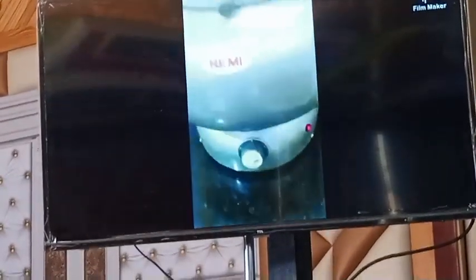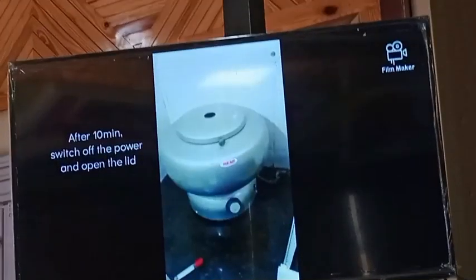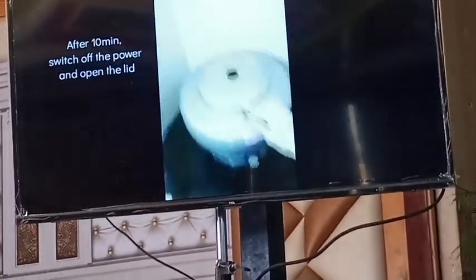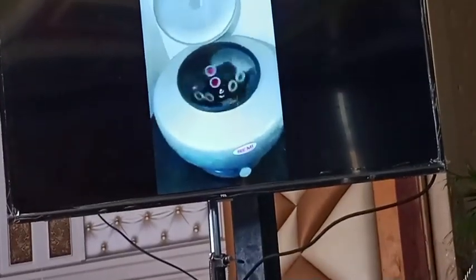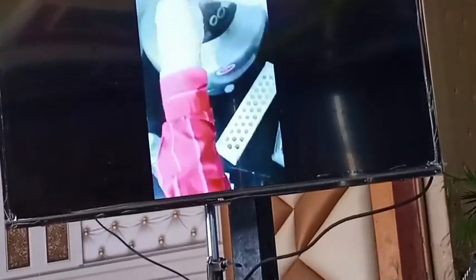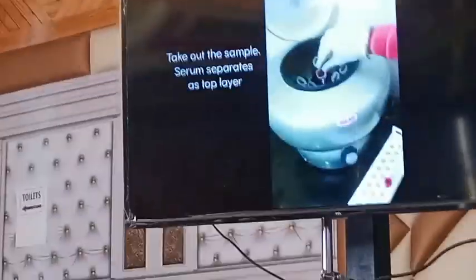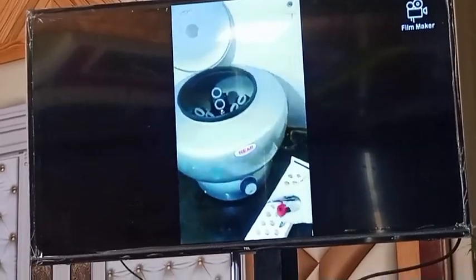We have a speed limit, and its speed is defined in ISO, so we have to make sure that we calibrate all our instruments to the speed. If I say that mine runs at 3000 RPM per minute, who will prove it? There's a calibration instrument. It calibrates all your instruments. So all your mechanical instruments, like even a pipette, are calibrated. In our pathology lab, it's a must to have records every 6 months to calibrate.